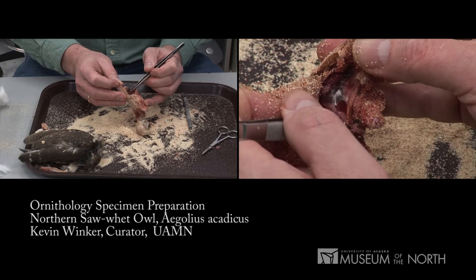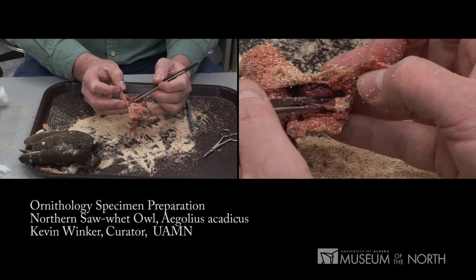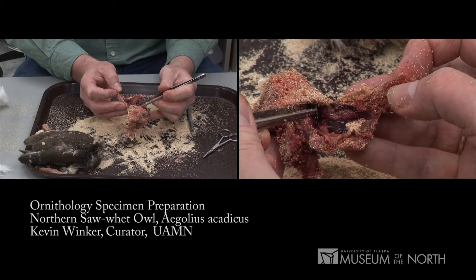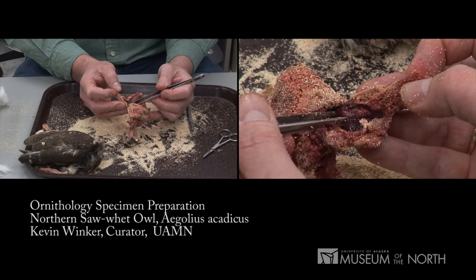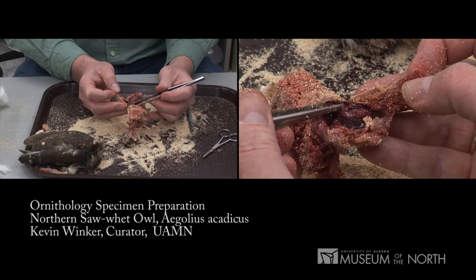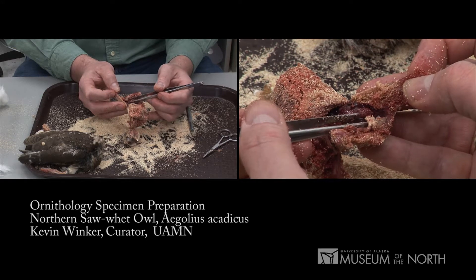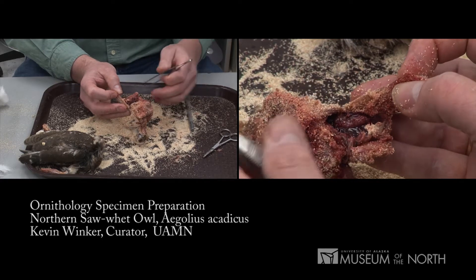I'm carefully pulling the intestines away and looking inside. What we have here is a female, and you can see the ovary here. It begins up here, ends down here, and all those little tiny dots are ova. It's a spring bird, as we knew from its date in March. These ova are enlarging as compared to these smaller ova down here. Now we know the sex.